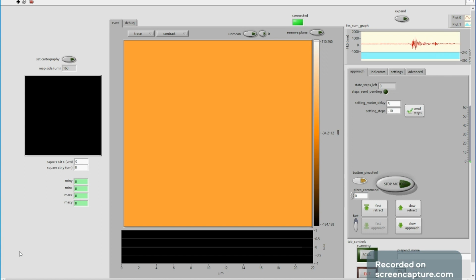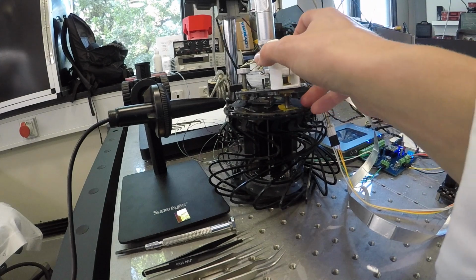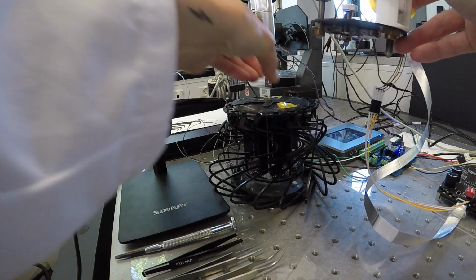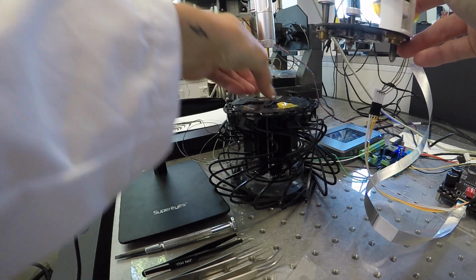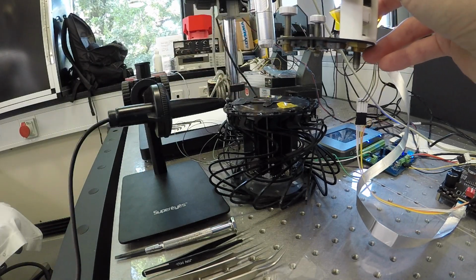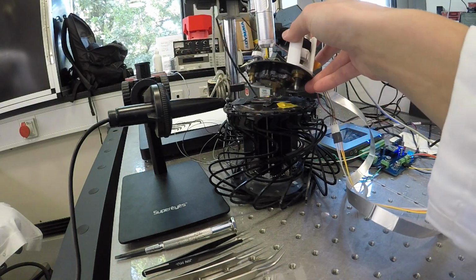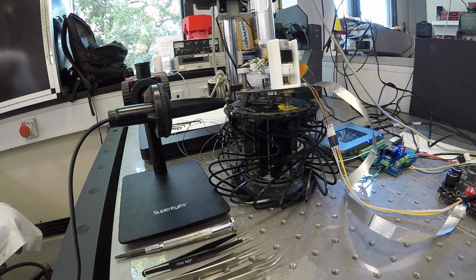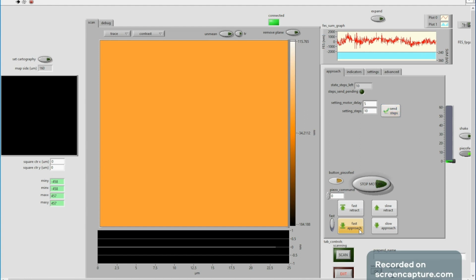So now we can calibrate by using a DVD. We here take advantage of knowing the exact measurements and distance in the DVD lines, and want to see how our measured volts can be converted directly to having the right ratio between voltage and nanometers.